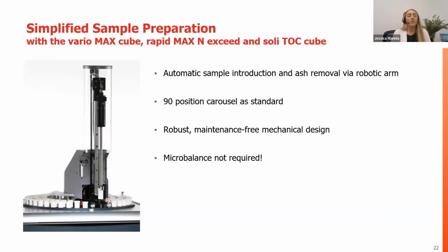Okay. When we're looking at these very large sample sizes, Elementar decided that it was much easier to go about a reusable container solution than it was to load very, very large tin foils. And that's also because of the ash that's produced, right? The bigger the sample, the more tin that we need to wrap around it. And so the more ash that's produced from combustion.